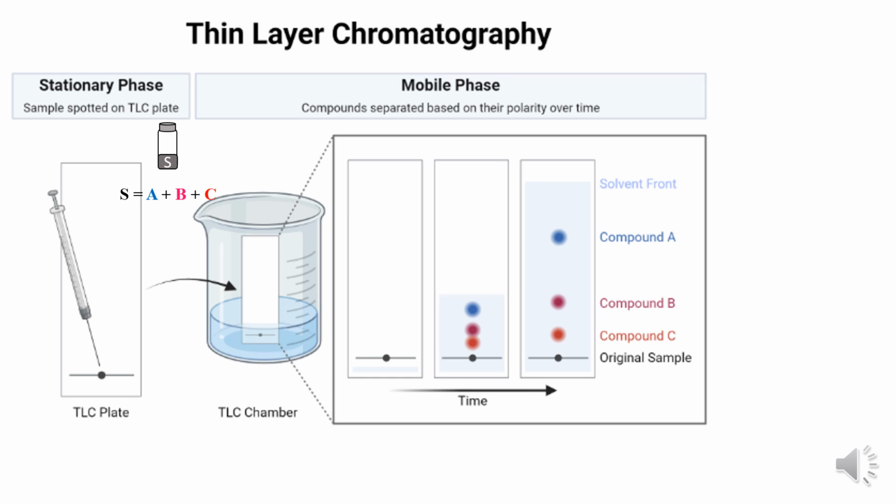Now, chromatography is a separation technique which is commonly employed for the separation of the given sample mixture into individual components. Now, the TLC plate is prepared by applying the silica gel slurry over the glass plate, whereby we get a thin layer of silica gel over the glass plate. Dry the plate, activate the plate.